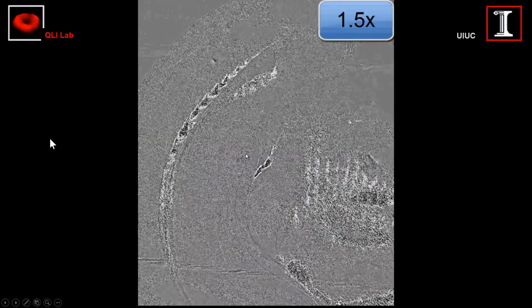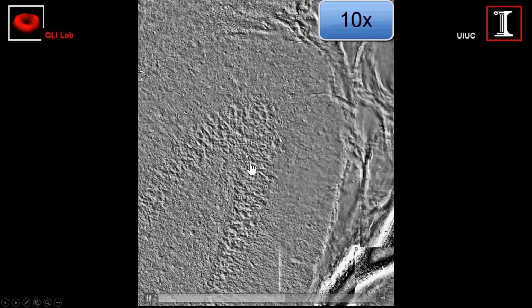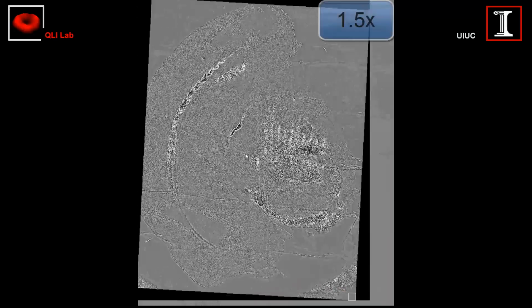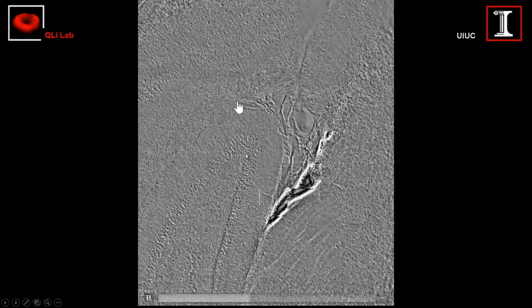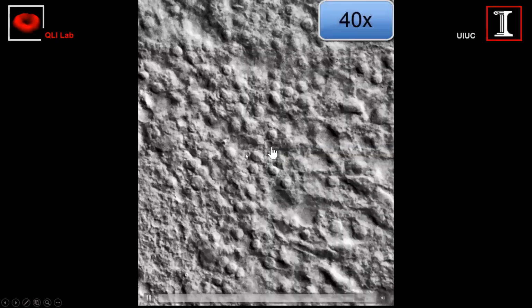One exciting application that we've been working on is to look now at brain slices. So these are models for neuroscience that are very powerful. They're extracted from the animal between 300 and 500 microns, and they can be kept alive for a few hours, meaning that you have access to actually full connectivity as opposed to the neurons I showed you in a dish.